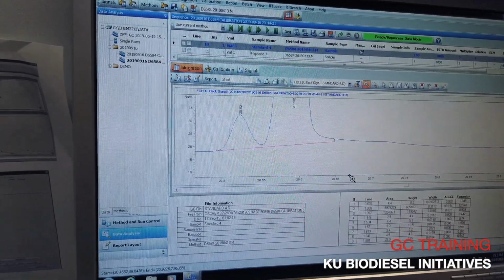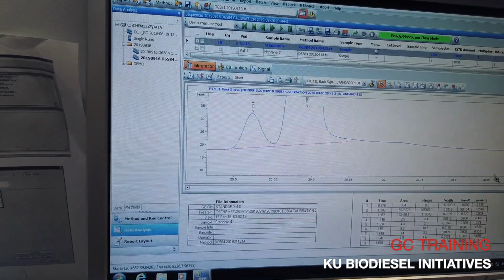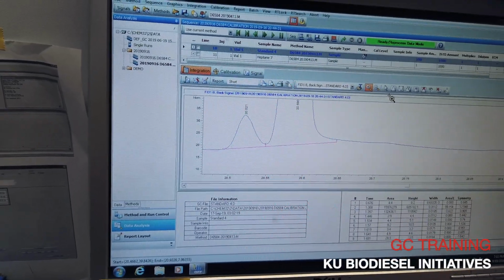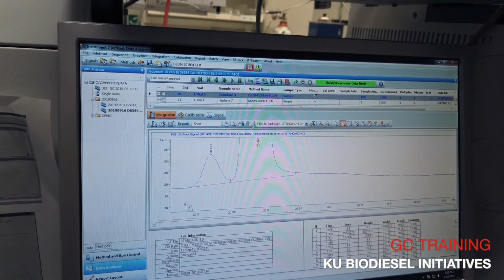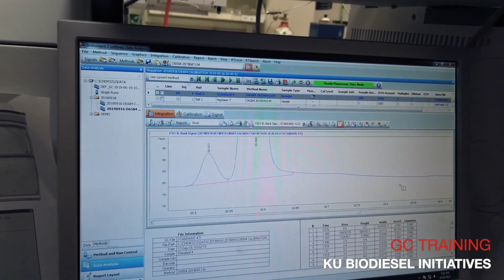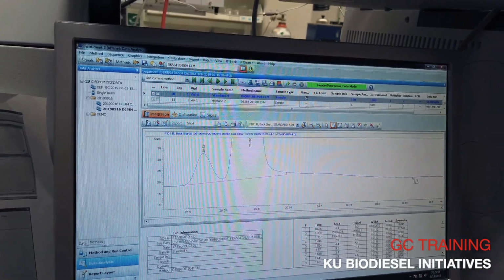So 867 would be right here. So that's what it's telling me. So 48 would probably be like here. So that means if you zoom it in through here, it's literally like to here.